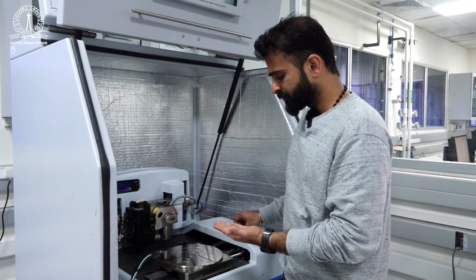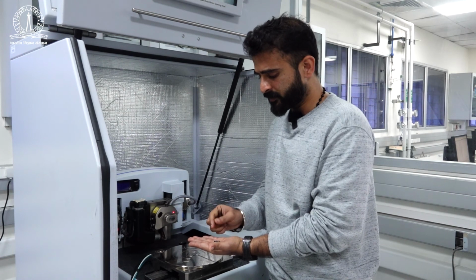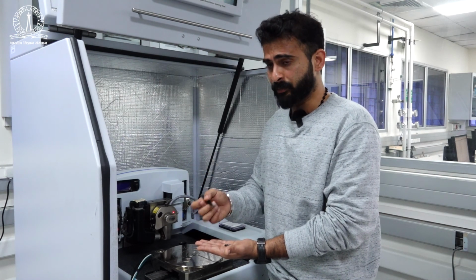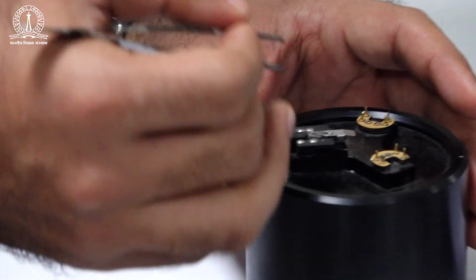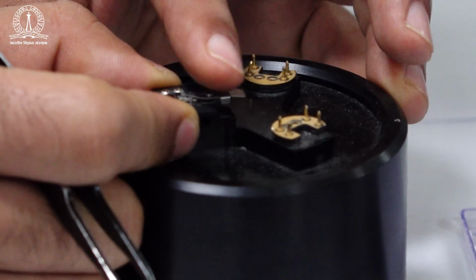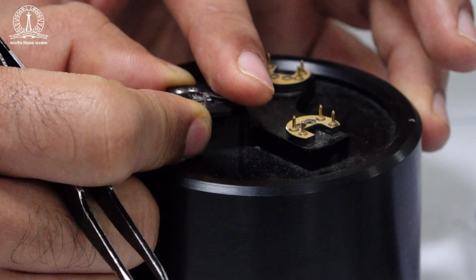Once that is done, this tip holder is taken back to the loading station over there, and the cantilever is removed and put in its cantilever box. Removing the tip or the cantilever is similar to how we loaded initially. Hold the tip holder, press the clamp over here and push it back.